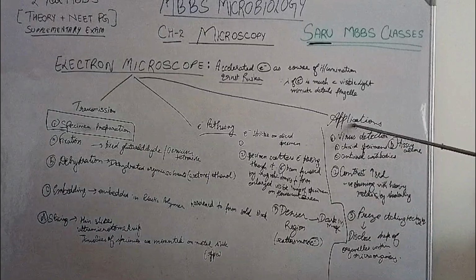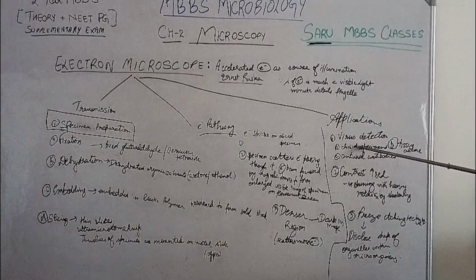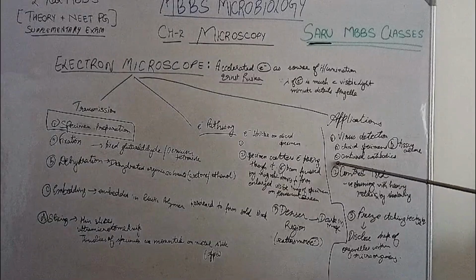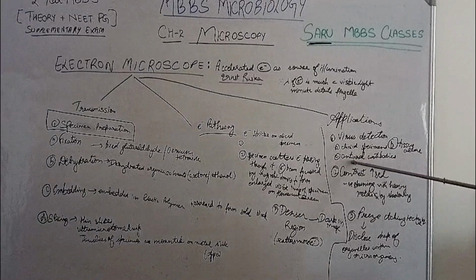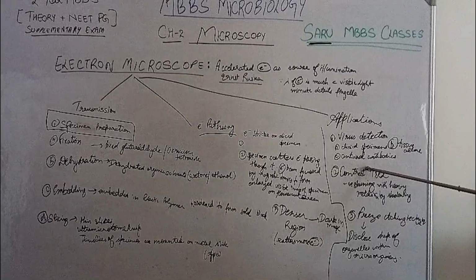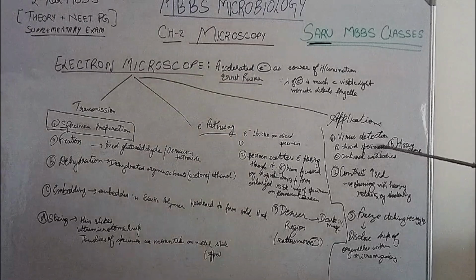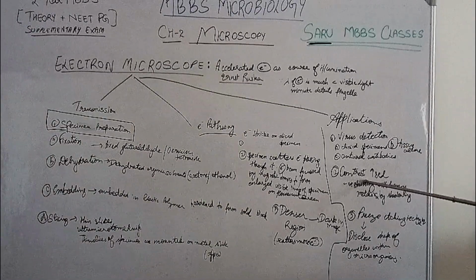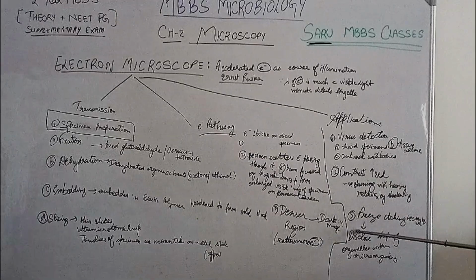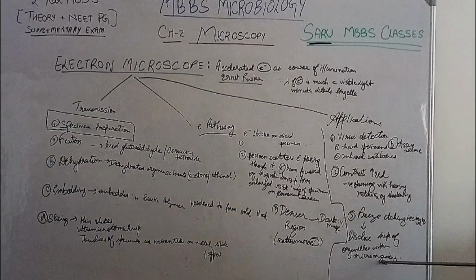The applications of the electron microscope: it is used for virus detection of clinical specimens. For example, in a stool specimen, we can detect the rotavirus. Antiviral antibodies are added specifically to the specimen, and also from tissue cultures. Then contrast is increased, for example, by negative staining with heavy metals and by shadowing. The freeze etching technique discloses the shape of organelles within the microorganisms.